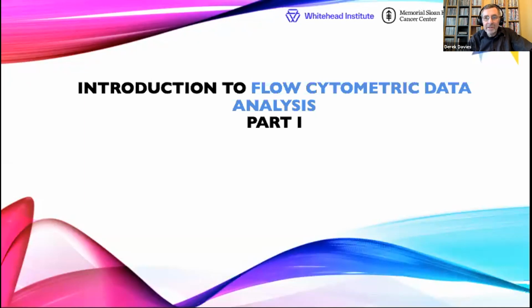And what I found over the years is that users will go off, they'll go back to their lab who may have somebody who's experienced in flow analysis, and they'll teach them what to do. But that person was taught by another postdoc who was taught by a different postdoc who may have been taught by a flow cytometrist. But that chain is getting so long, it's a bit like Chinese whispers.